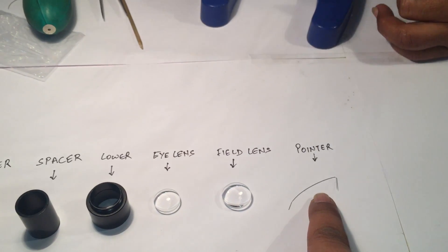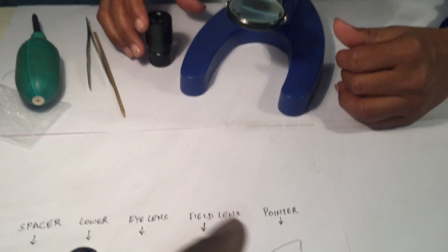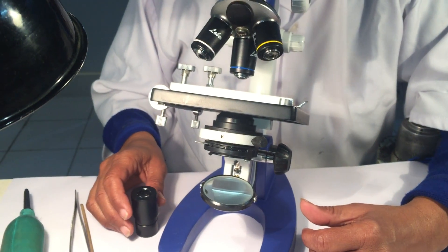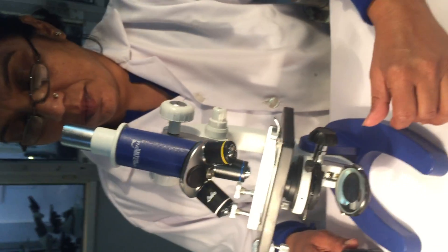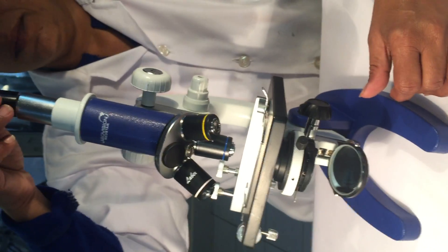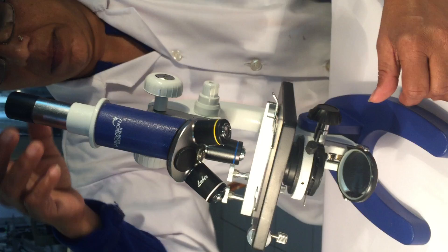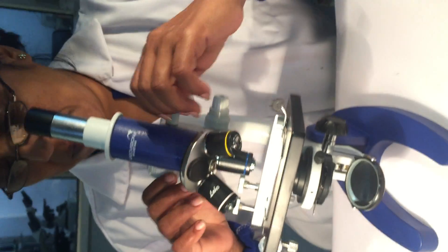In our second video, we will tell you how to fix the pointer. So now we are placing the eye lens, placing the 10X eyepiece on our microscope and then we will check the clarity. Thank you so much folks.